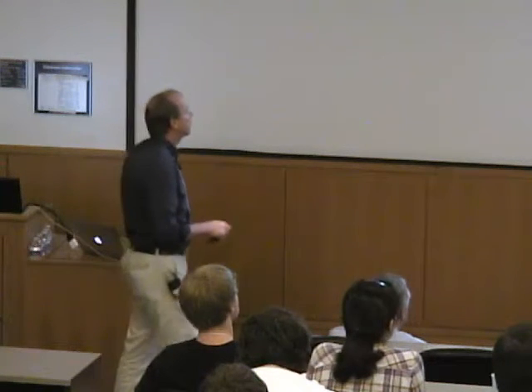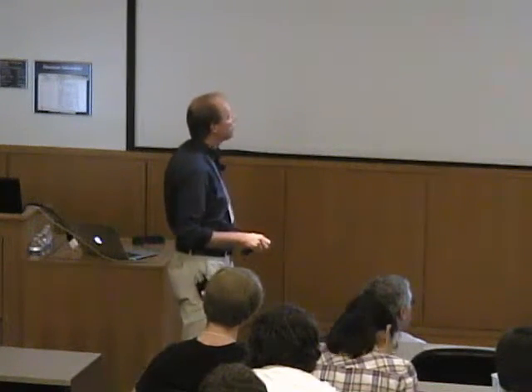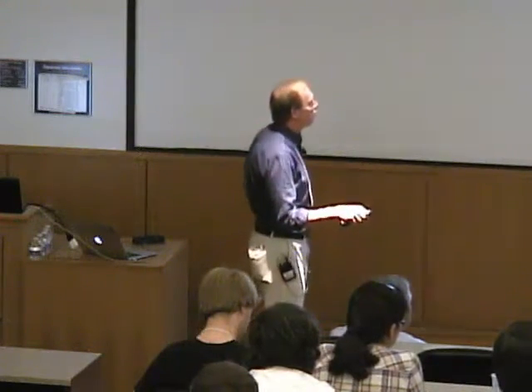For spin equals 1, there are 3 possible orientations. And so for my energy levels, spin up for the electron or spin down, each of those levels gets split into 3 through the interaction between these 2 species. And so in my EPR spectrum, I then have 3 possible transitions at different frequencies.